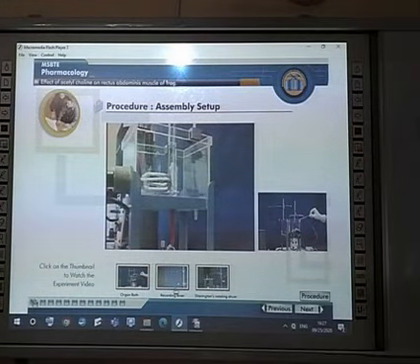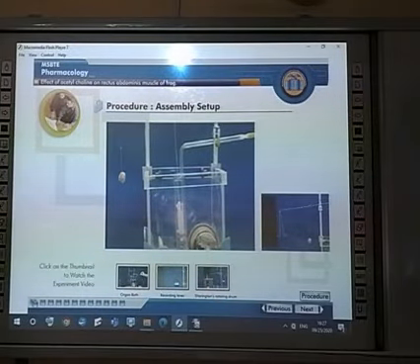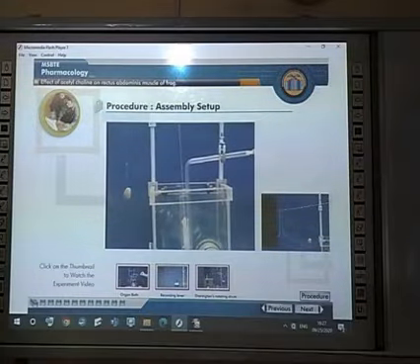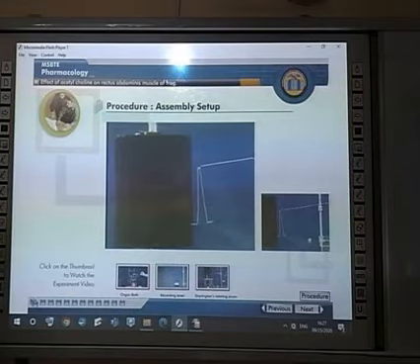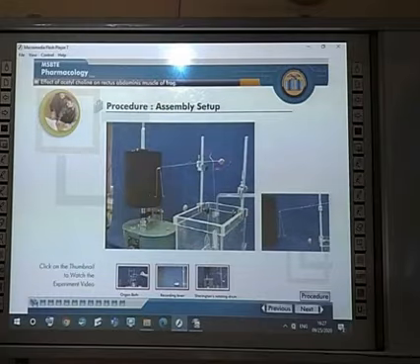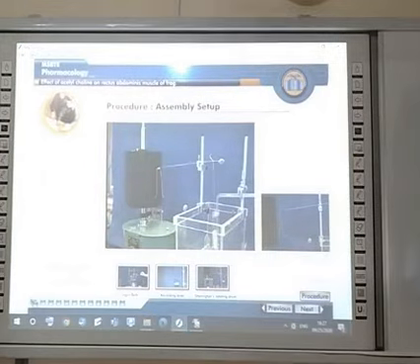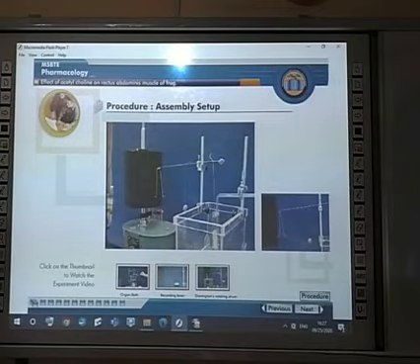Next, the recording lever, that is the frontal writing lever setup. To record the responses of drugs on muscle preparation, one can use either a simple lever or a frontal writing lever. The frontal writing lever is made of light aluminium and is designed in such a way that the writing tip rotates freely on its axis. For proper recording of responses, adjustment of magnification of the lever is necessary.